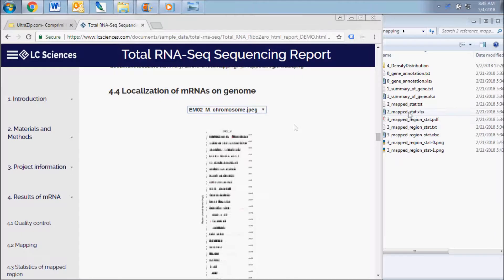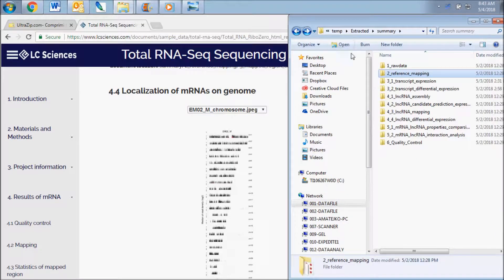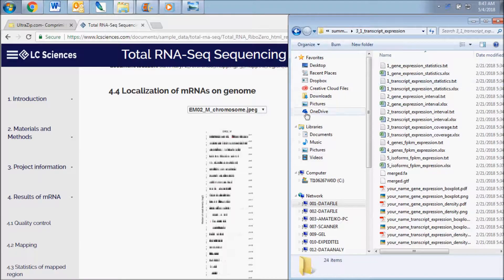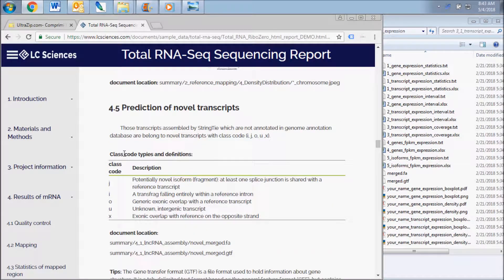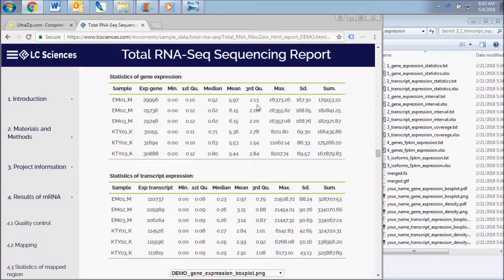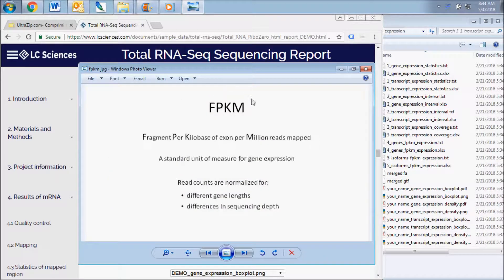The next results subsection displays data contained in the transcript expression data folder. This includes expression data and statistics for both genes and transcripts in each sample. The first two tables show the statistics of the number of raw reads mapped to each gene or transcript. Charts and graphs from this point forward contain expression data and statistics based on FPKM calculations from raw read counts. FPKM refers to fragment per kilobase of exon per million reads mapped and is a standard unit of measure for gene expression. Effectively, read counts are normalized for different gene lengths and differences in sequencing depth.